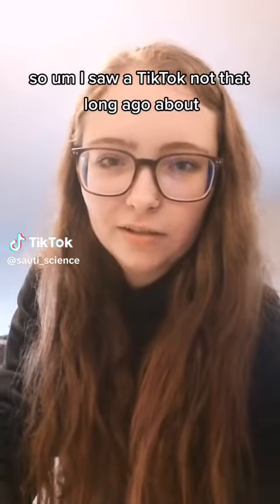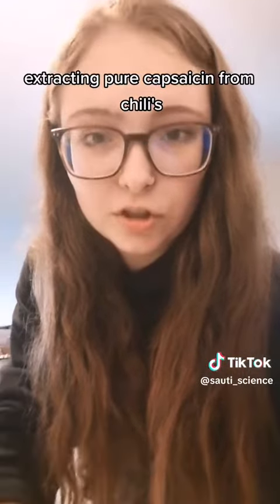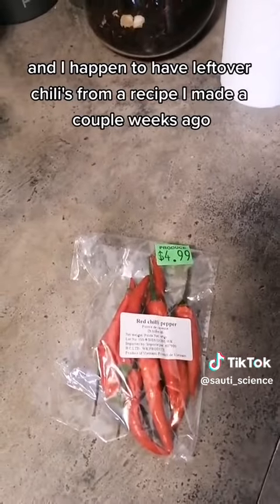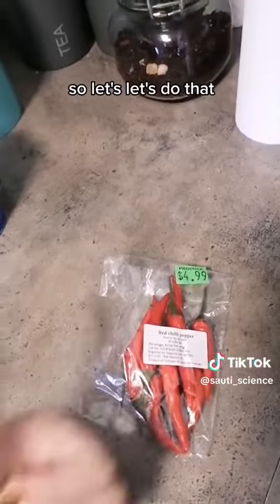I saw a TikTok not that long ago about extracting pure capsaicin from chilies, and I happen to have leftover chilies from a recipe I made a couple weeks ago, so let's do that.